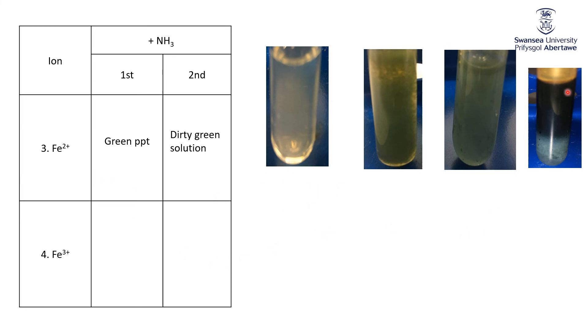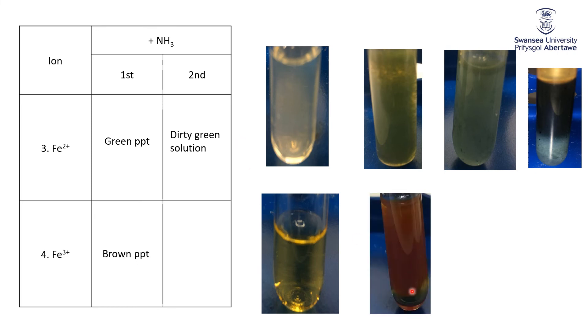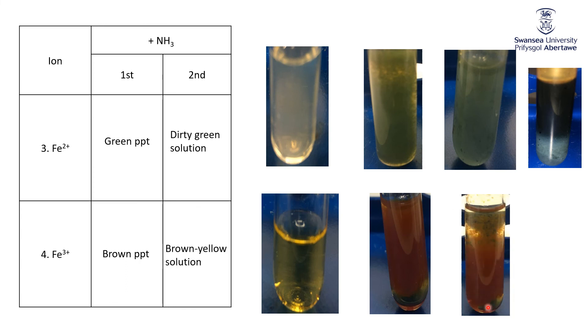Talking about Fe3 plus, when it's just Fe3 plus in water, it's that yellowy brown solution. Add in some base, and you get that brown precipitate. Again, familiar, or should be familiar to what we saw when we added sodium hydroxide. Again, I've let it so that you can see some of the original solution there, but there's the ammonia being added. Add more ammonia, and you can see here it's starting to dissolve it up again into a browny yellow solution.